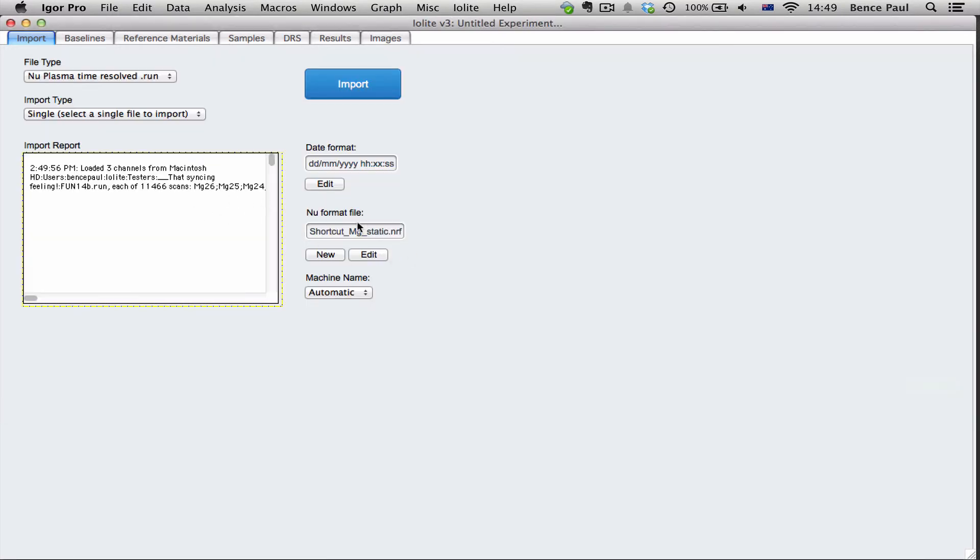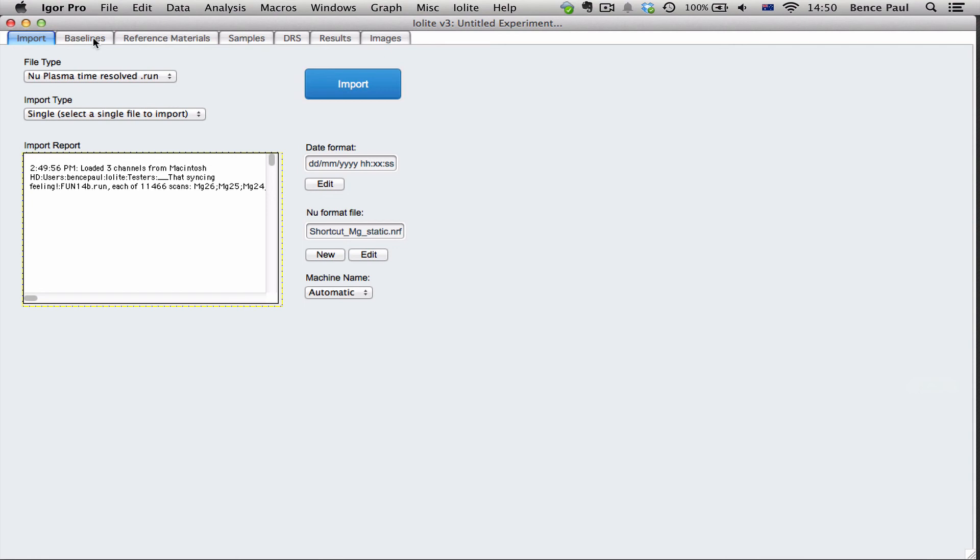We don't have to create a format file every time we want to import .run files. It's only for the first time that you import a .run file that has a new format file. So I hope that explains it for you. If you have any troubles please feel free to post to the forum and we'll help you out. Thanks very much.